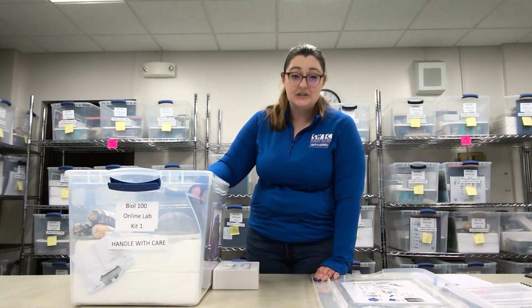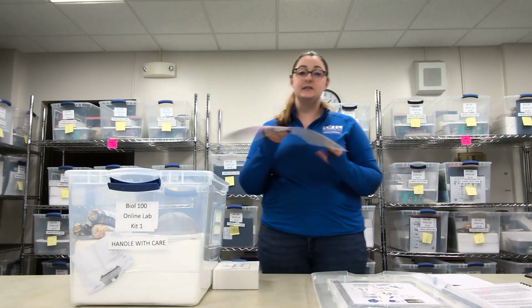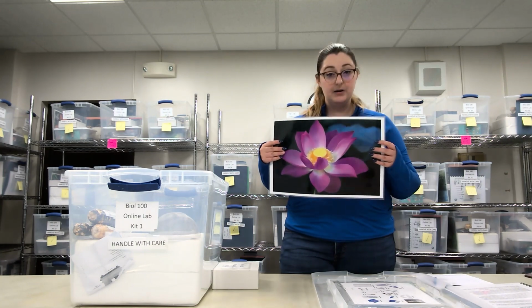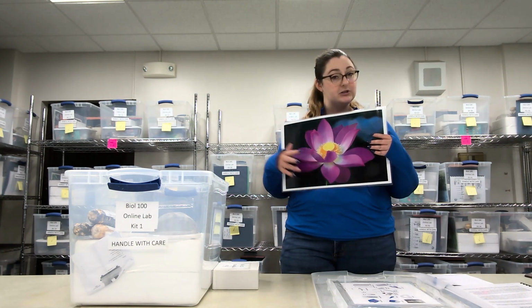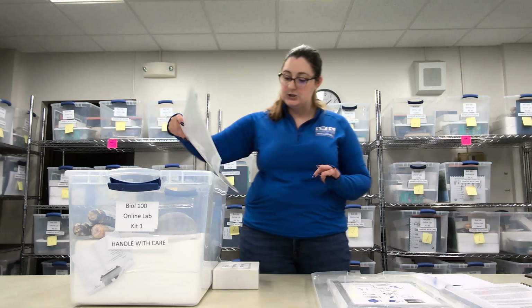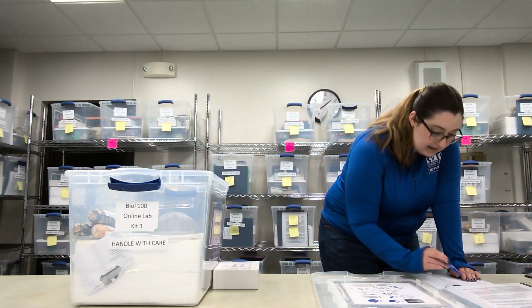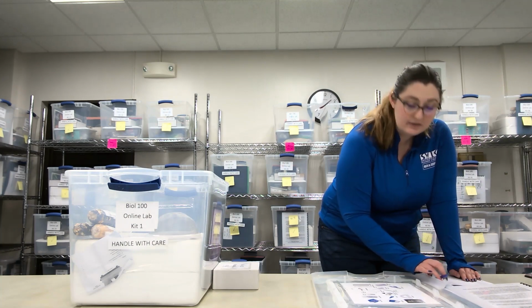You'll notice that I didn't get this one out, but it is in the kit. This guy right here, just a laminated kind of poster of a picture. Everybody's picture is different. Go ahead, make sure you have one of those. Slide it in, and we will check that off.